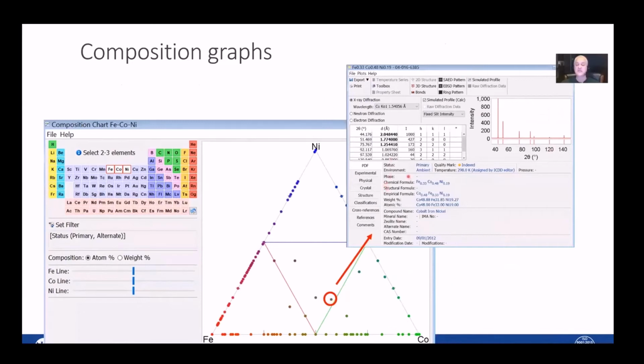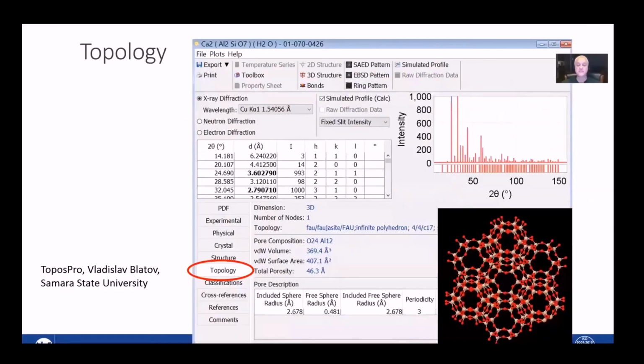You'll get the information, including what's the composition, lattice constants. If atomic coordinates are present, then you can get that information as well as the 3D structure. So it's another way to find out what has been done, what's in the literature, what information can you grasp from crystalline structures of ternary compounds.